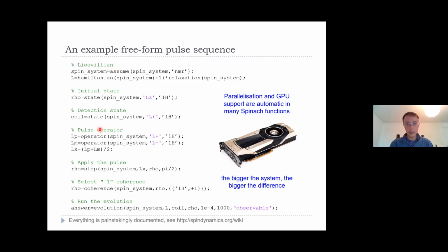So all of this, when you look at this code, put a mouse on it, press Ctrl+D, MATLAB automatically opens the source code of that function. You will see the instructions for use in the header. Everything's documented, everything's commented, and everything's on that wiki as well.